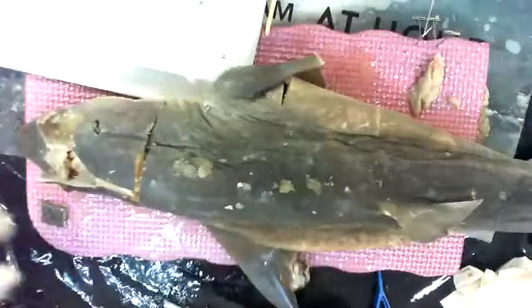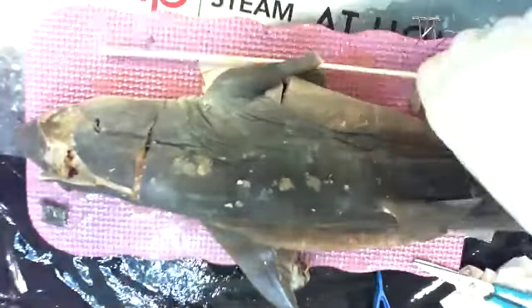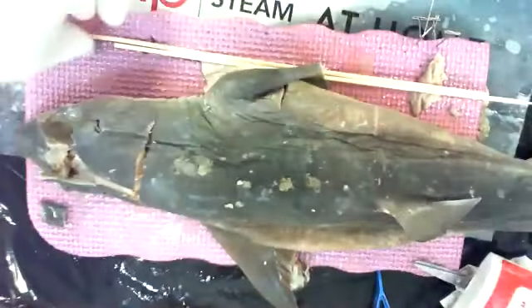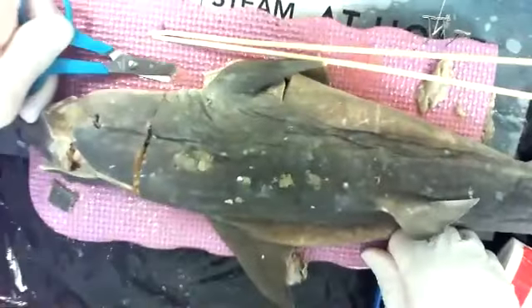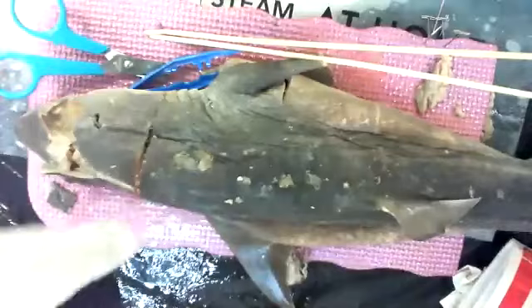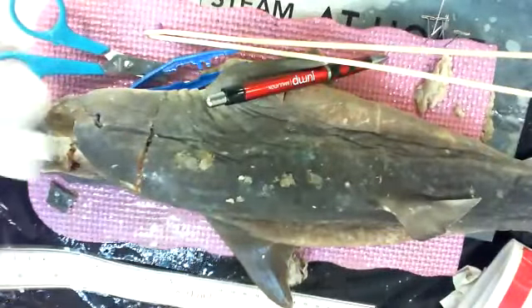We are way out of time, so I'm going to show you how to clean up. Love the cleanup. It's the best cleanup of any messy job you'll ever do. I take all my sharps. I don't know how I got 2 probes. I point them. I stick them into the pad. Take my scissors. I stick them into the pad. Like that. Make sure everything's accounted for. Ruler. All these pieces.